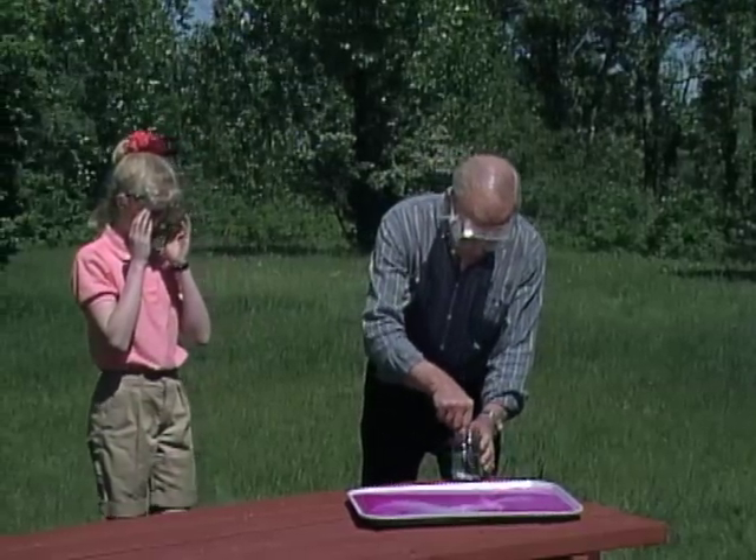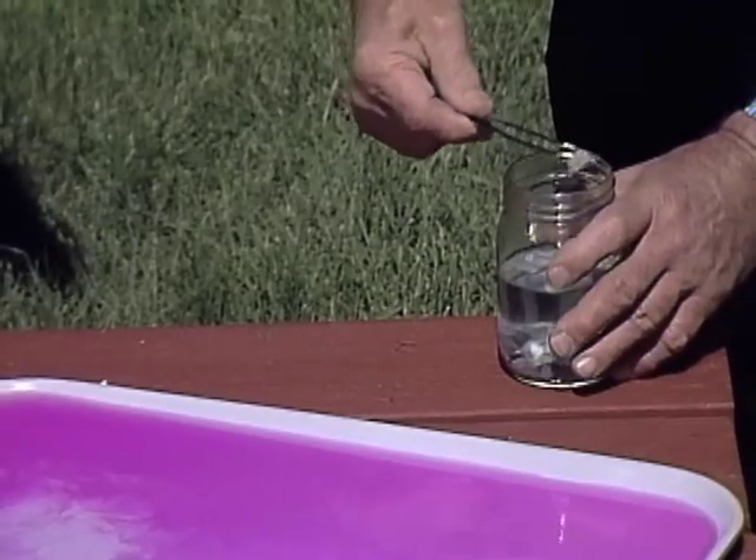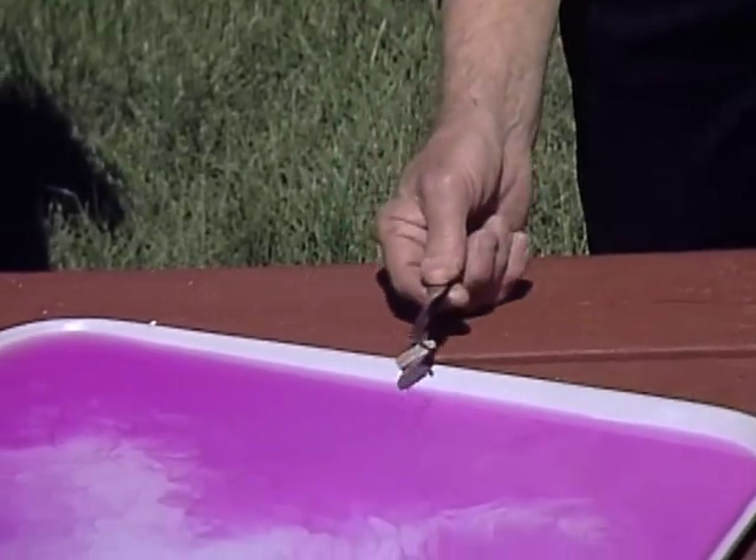A little bigger piece this time — stand back as we see what happens when the element sodium contacts water.